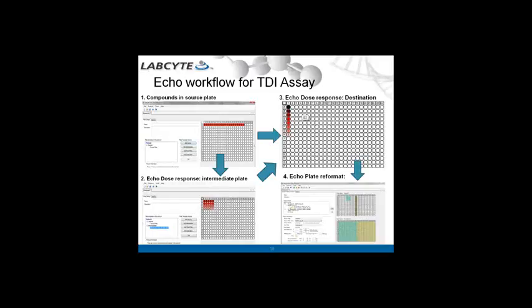And at the very end, you can make human liver microsome dissolved in buffer with and without NADPH and transfer the human liver microsome into the destination plate containing compound. This procedure can be saved as a template for other time-dependent inhibition determinations later on.